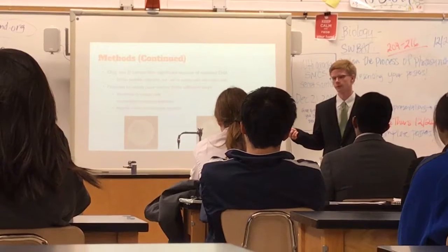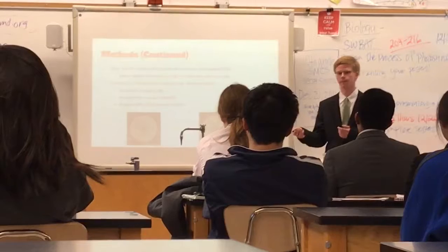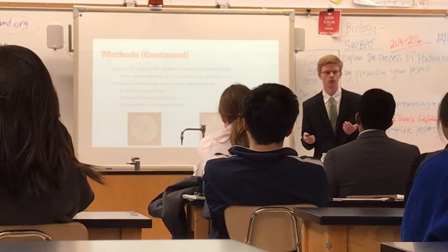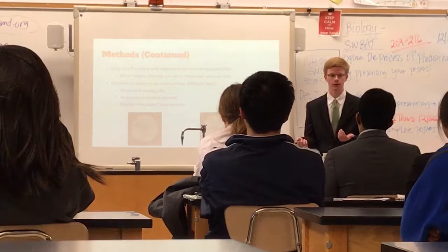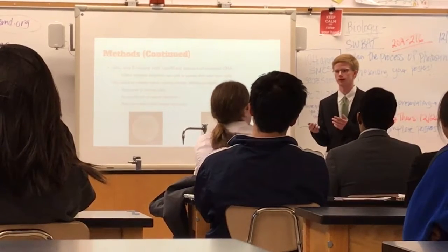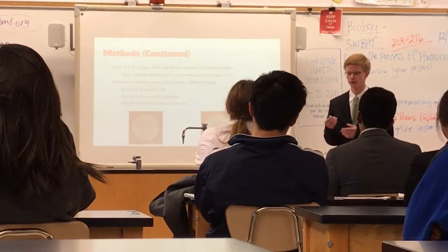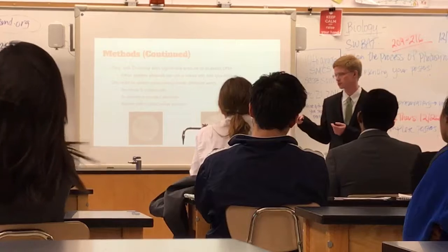Another one was to retransform the mutated plasmids. I had more plasmids that I hadn't put into E. coli from my previous QuikChange, so I put these into a new strain of E. coli, grew them out, and saw what I got. And then another one was to repeat the QuikChange process all over again, in case you had this problem with the plasmids. But this wasn't quite necessary, it was more of a learning experience.